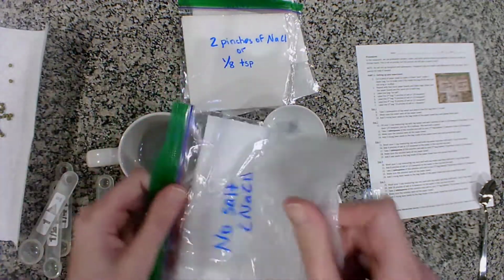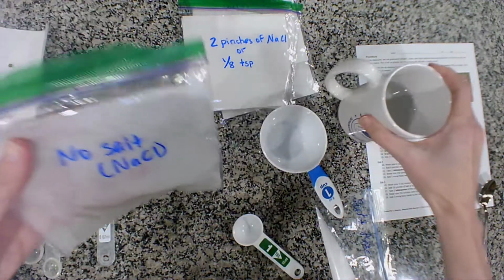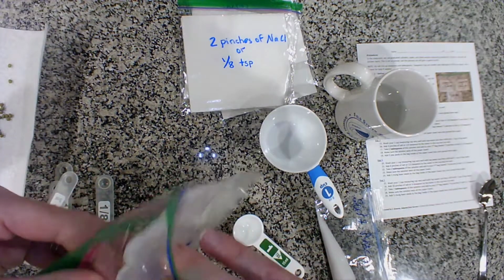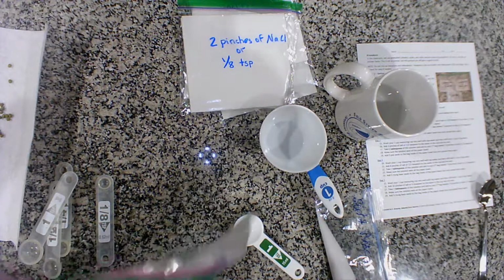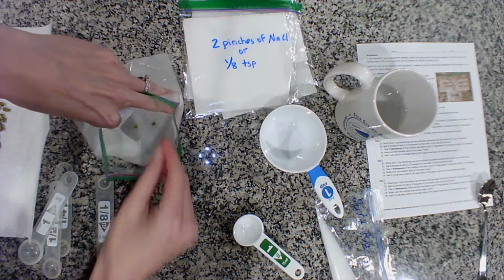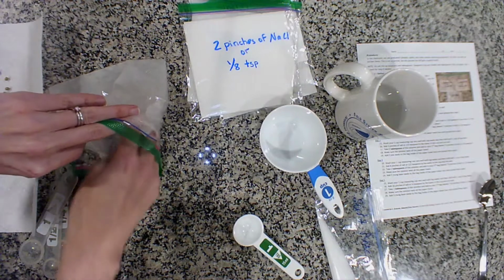Okay, I want to make sure that all of the paper towel gets wet, and just make sure that the water gets all around. Okay, I'm going to move this aside. Then I'm going to take 5 mung beans and place them inside my taco. Remember when you put in your paper towel, you put the fold in at the bottom. Now let's see if I can find where it separates here. Okay, here's my taco. So I'm going to take 1, 2, 3, 4, 5. Now I want to spread them out pretty evenly, so they're not all smushed together.